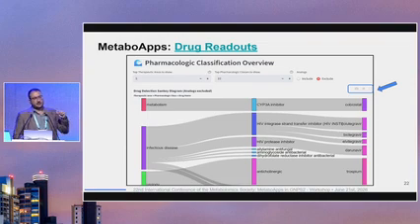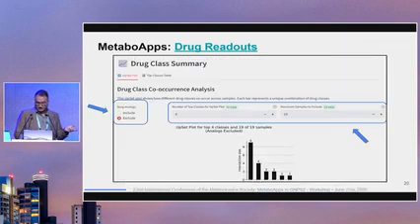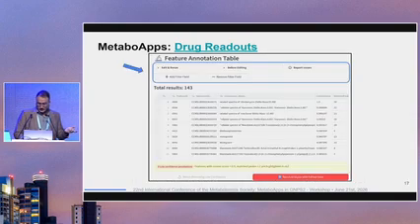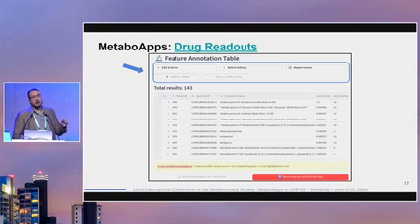So you're going to have a parent drug, for example, metoprolol, a hypertension medication, but you can have slightly small modifications on that structure.